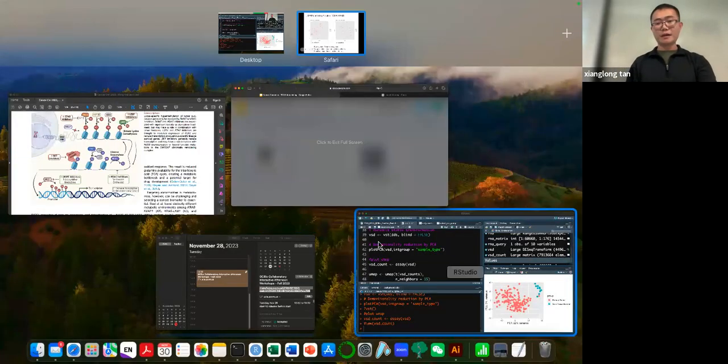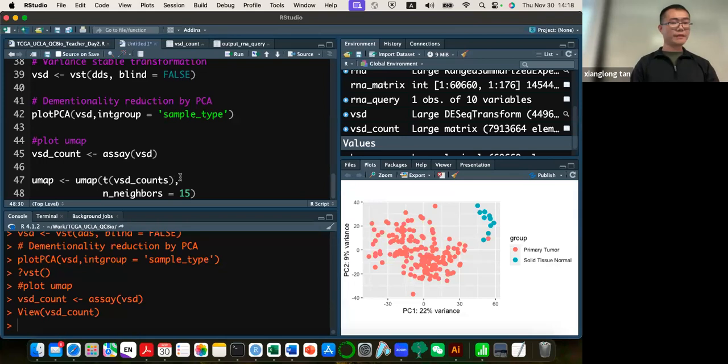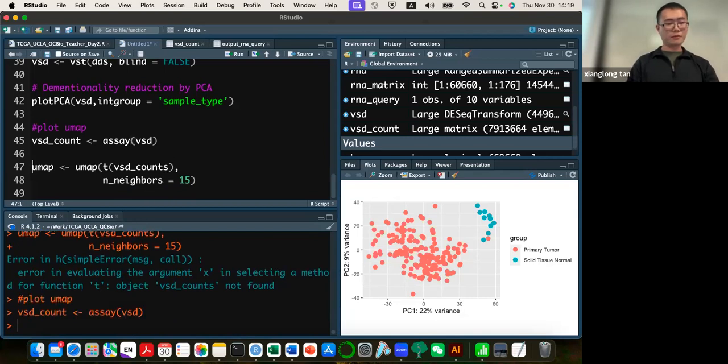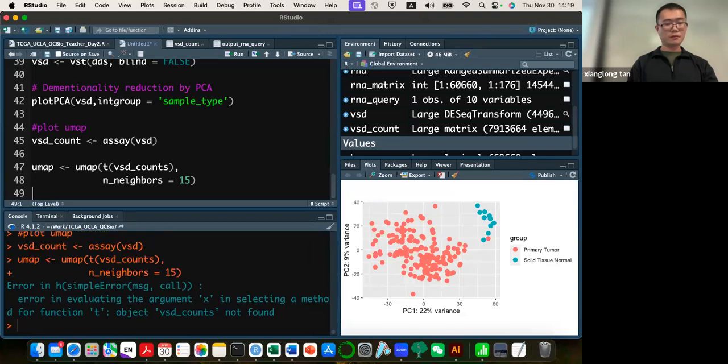So by default, I'm just going to use 15 and do the calculation. I'm going to run this again.